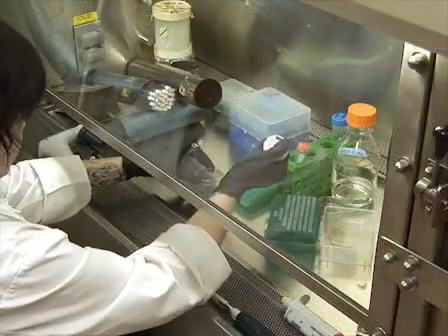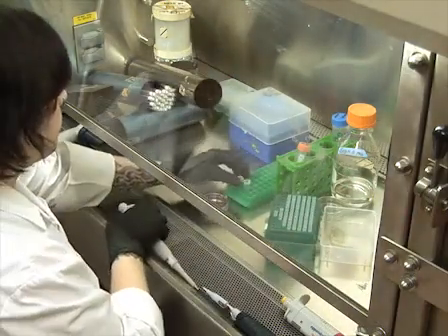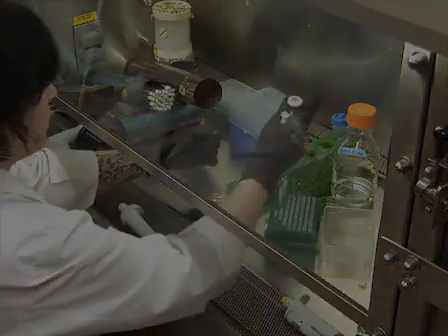Add EGF and FGF before placing the dishes in the incubator. These growth factors will need to be replenished every 2 days for the entire length of the culture.